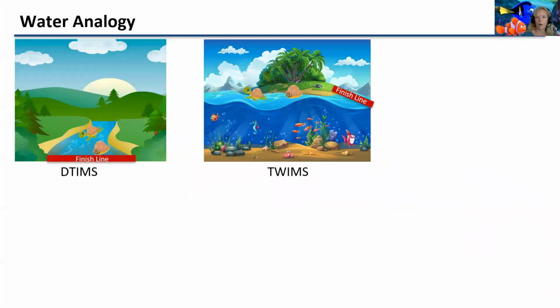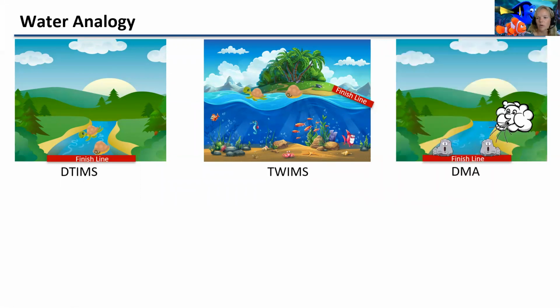So now let's use our water analogy, and this is where I'll finish up today, and that's about how far I got last time, to relate all of these ion mobility techniques. If we start with our drift tube ion mobility and our traveling wave, we can see that Simon is going to hit the finish line first in both of these cases because he's a more compact structure than Garfunkel.